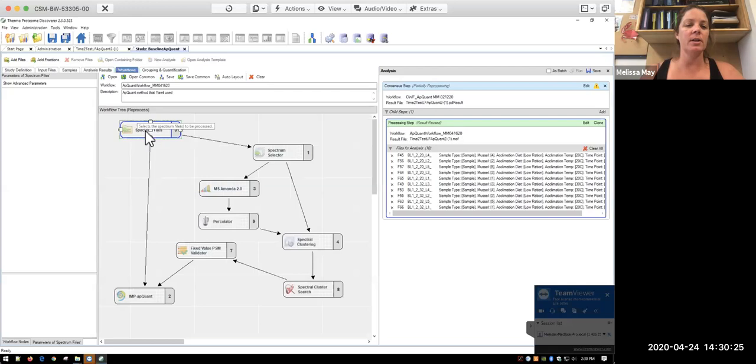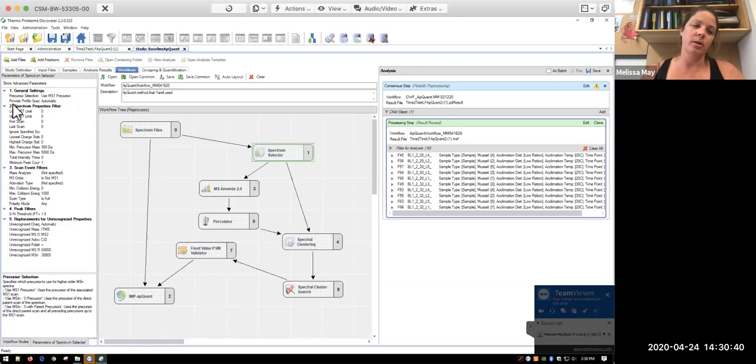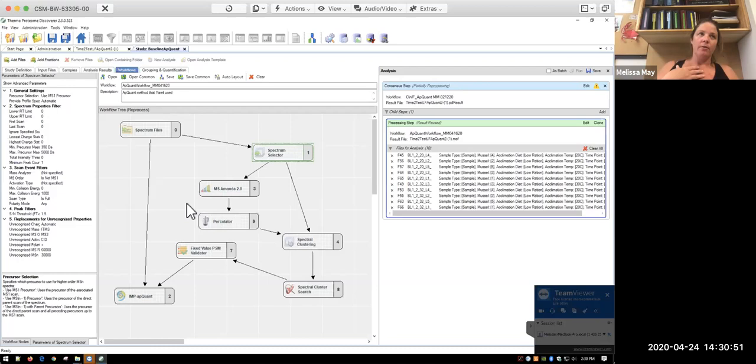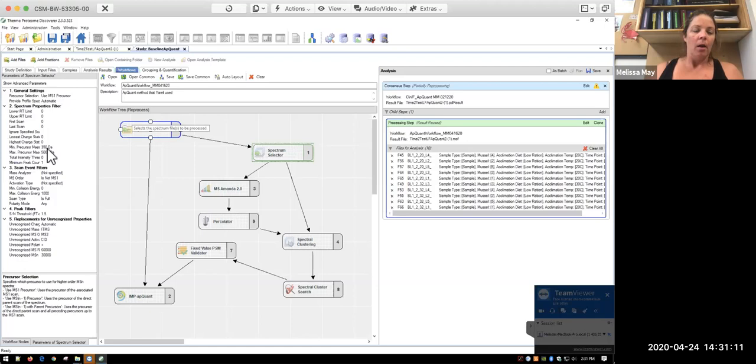So I'm going to have to put that back in, but we'll go through that. So walking through this again, you have your spectrum files. This basically just inputs your spectrum files that you're going to process. Your spectrum selector takes them and then further processes them. So for the spectrum selector, basically what we're telling the program that we want to do is that it's going to take the MS1 precursor. And so when you do your full MS for every group of ions, for every M over Z that's getting sent in and analyzed by the mass spec, you have your different isotopic peaks. And so this is going to take that precursor ion for whatever MS1 you have. And it's going to use that to continue with the processing.